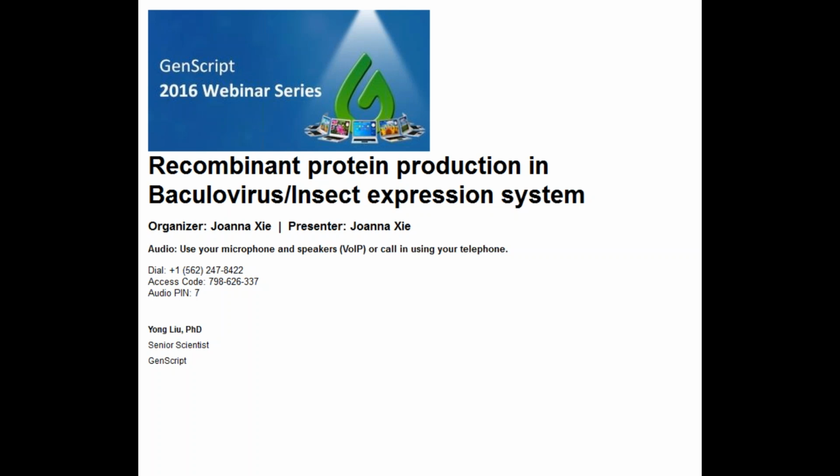And some of the parameters here: insect cells are maintained at 27 degrees, and the cell viability should be more than 95%. Usually the infected cell density should not be more than 2 million. And another advantage over the mammalian cell expression is insect cells do not need carbon dioxide, and we need oxygen and pH. Ideal pH is between 6.1 and 6.4 for growth.